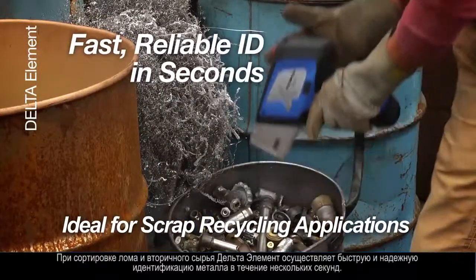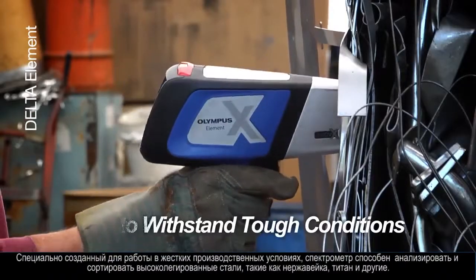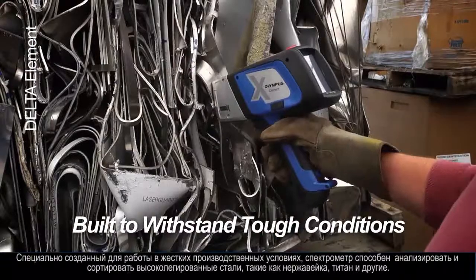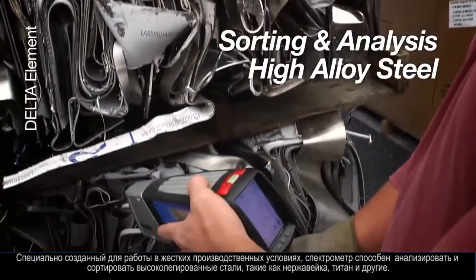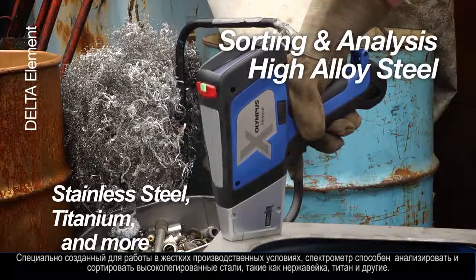For scrap recycling environments, the Element provides fast, reliable ID in seconds. Designed to withstand the toughest processing environments, the Element enables sorting and analysis for high-alloy steels such as stainless steel and titanium.